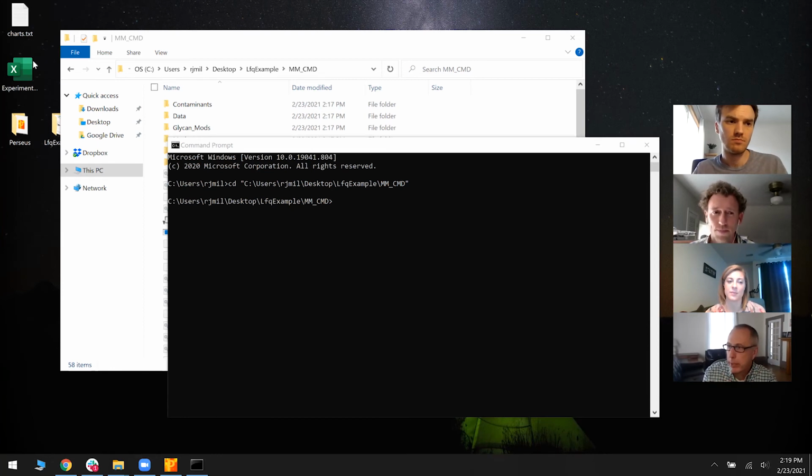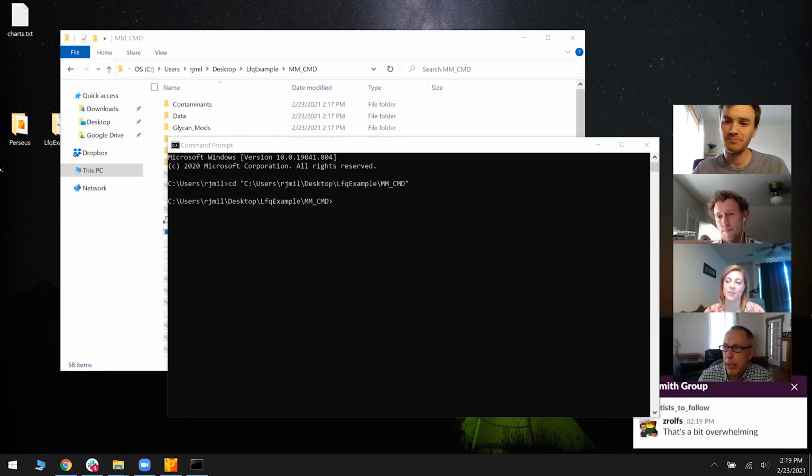It already prints out the results. It does all those things already. And then you can focus on the smaller task of adding the functionality, okay? And it's got to work in the whole. It can't crash everything. It's got to be bug free. And in this way, as long as we continue to add functionality to Metamorpheus, it will live, okay?